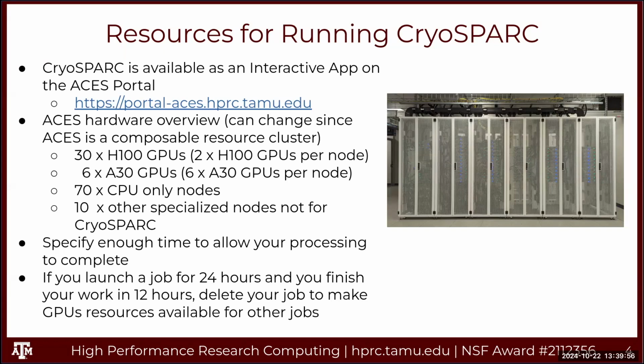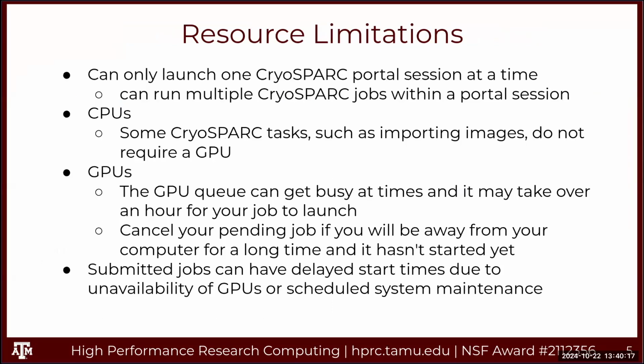And if you launch a job and resources are busy and it doesn't start right away, and you need to leave, you want to go ahead and cancel that job, because it may launch while you're away and it'll be using up resources while you're sleeping overnight if you leave it open.